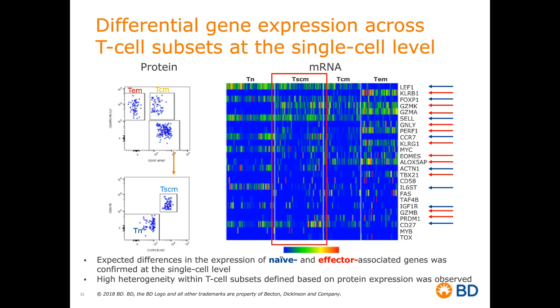Again, this strongly reinforces the concept that not all the cells that we've sorted within a gate are equal, and they have differences in the gene expression profile. Notably, you cannot find 2 cells that share the same profile, really emphasizing the need for a refined way to look at these cells and characterize them.